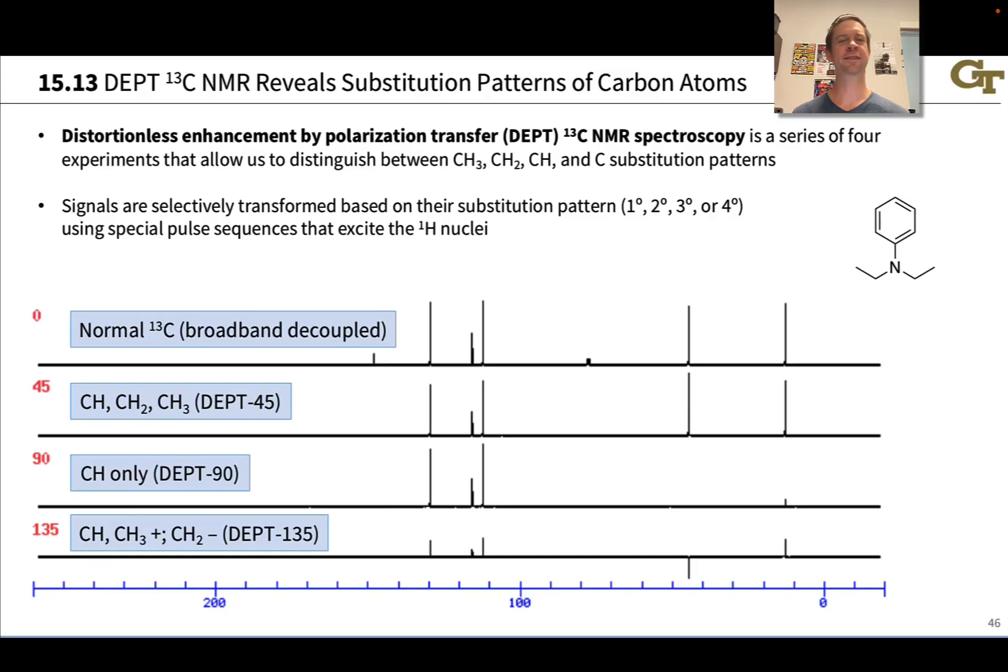To appreciate how to work with DEPT spectra, I think it's easiest to work in the context of an example. We'll look at the DEPT spectra of this compound which contains some CH, some CH2, and some CH3 groups. DEPT will allow us to distinguish between these different types of carbons with different substitution patterns, which helps in assigning each signal to a particular carbon within the molecular structure.